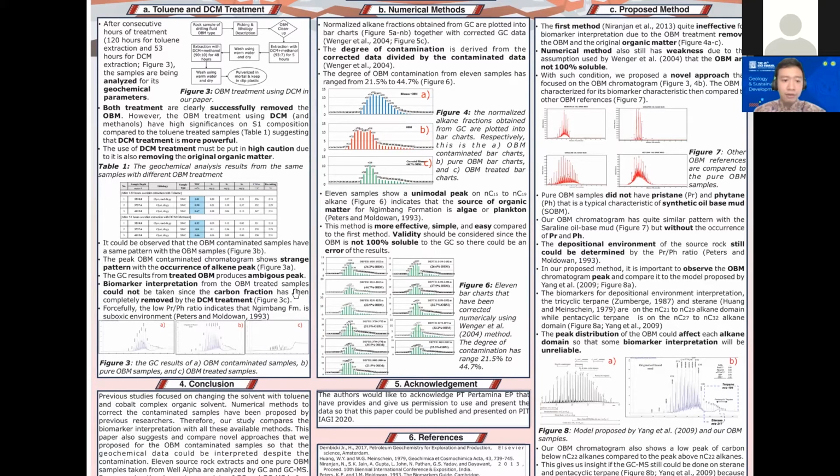Now we can see that changing the organic solvent into another solvent is still the same. It does not change the conditions for analyzing the contaminated samples. So we use another method proposed by Wenger et al. 2004 with the numerical methods.